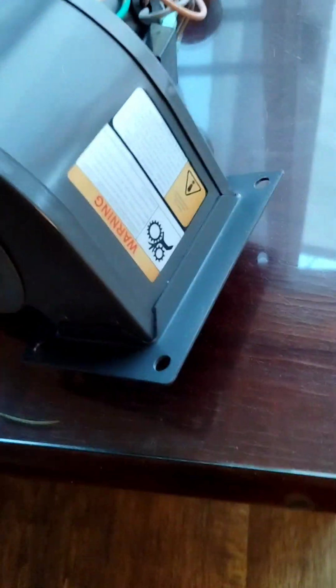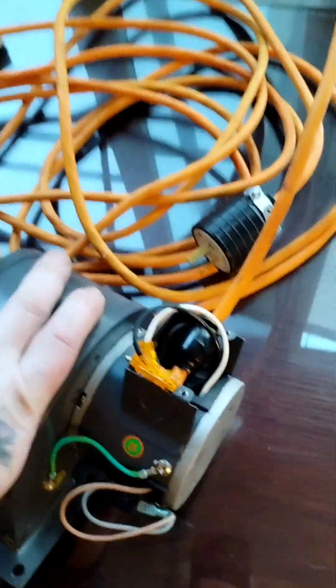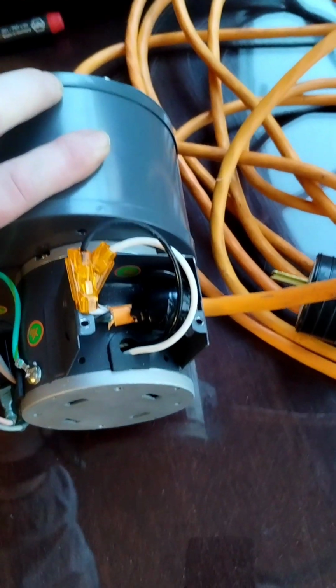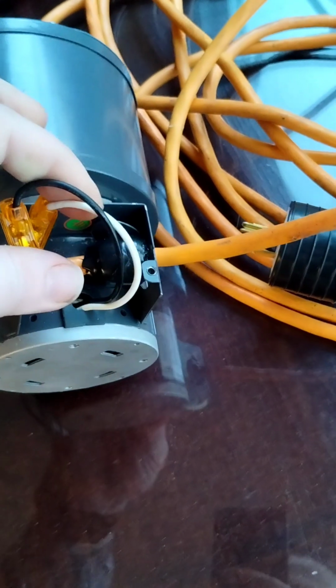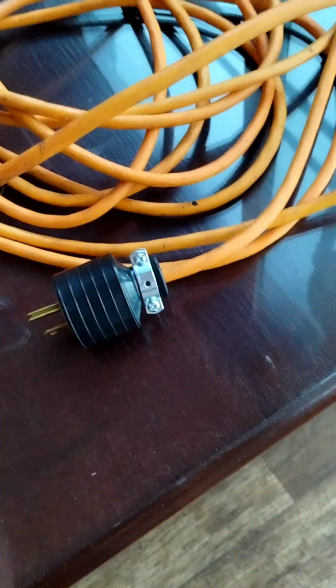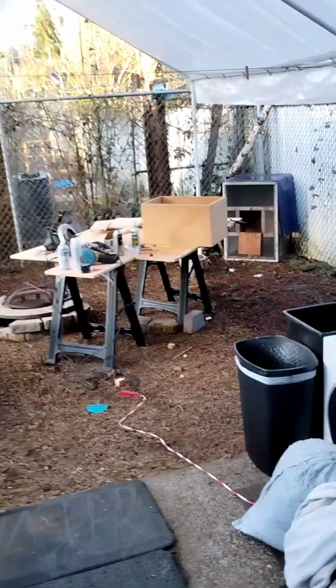This is the blower fan that I got for 80 bucks off Amazon. You have to wire a plug-in yourself. I just cut an extension cord, and it's pretty self-explanatory. Black goes to black, white goes to white, and then there's a ground. I tested it, it works. Now I'm gonna cut a hole in the top of the box and install it.